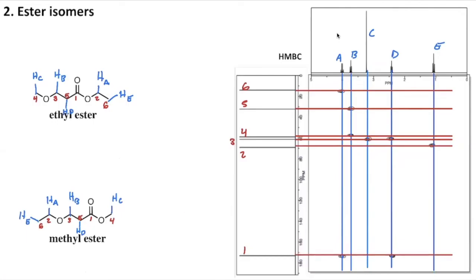like so. Okay, so now we've got a lot of things going on here, a little bit of a spreadsheet look, maybe a little bit of a plaid tartan look. I want to sort through all of these to nail down the correlations that we're seeing, and then we can sift through them one by one to see where they do or don't exist on our ester isomers.